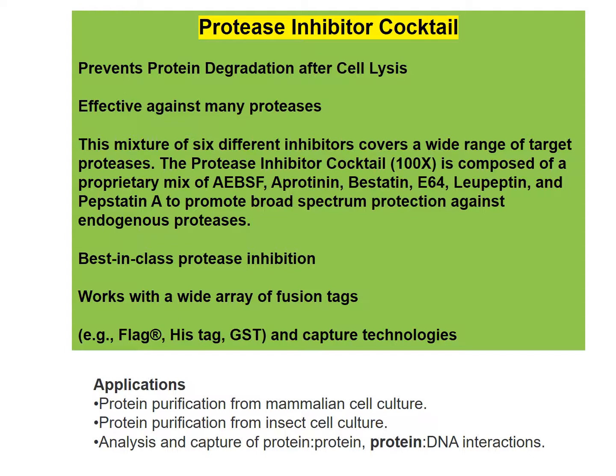So these cocktails prevent protein degradation after lysis. And you're saying, well, why don't you pop the cells open and then add the cocktail?